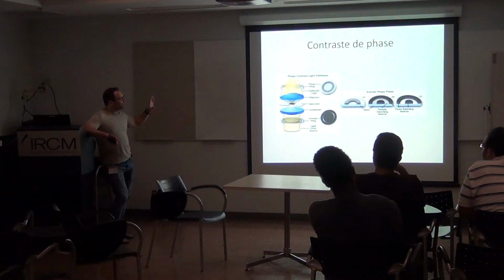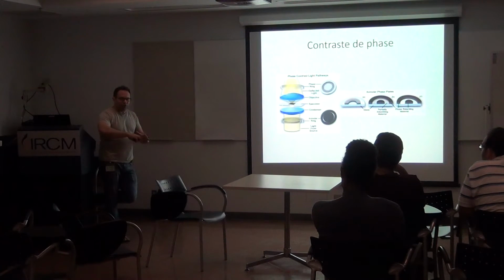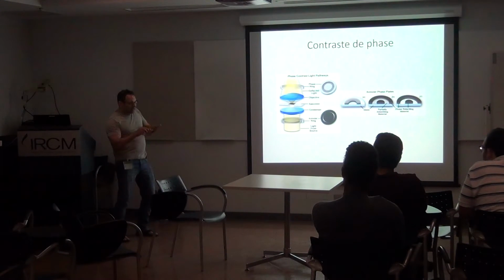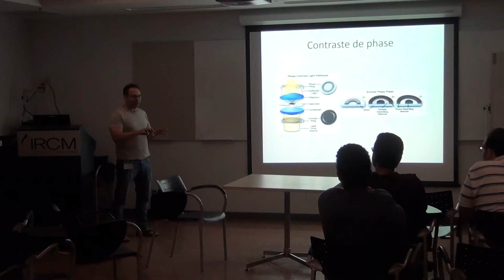And it's also widely used because when you look at a cell culture in a Petri plate in bright field, you're not going to see anything because cells are really translucent. Even with really nice magnification, you might see some shadow of something that you can figure out is a cell, but it's going to be difficult.